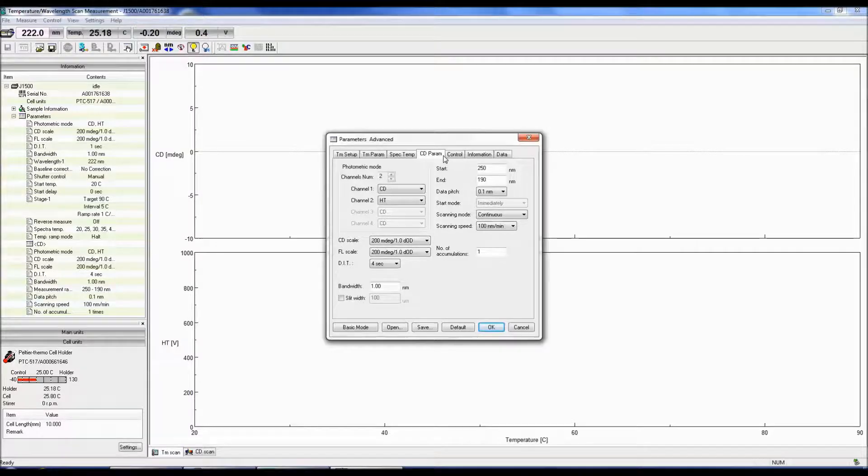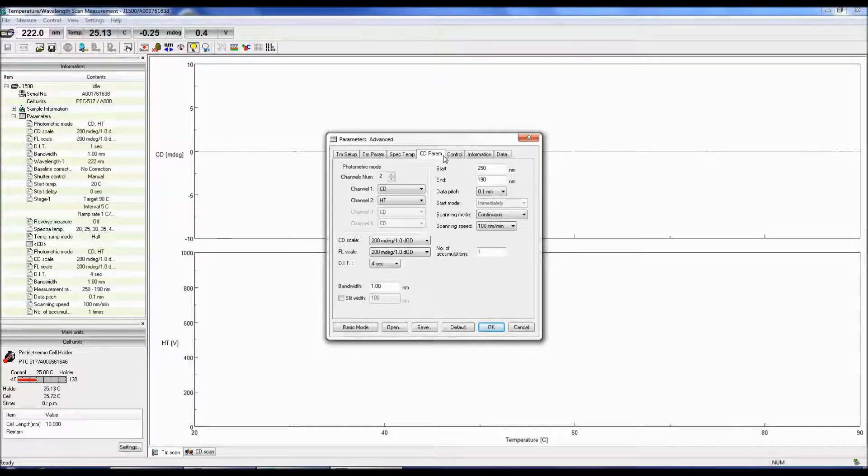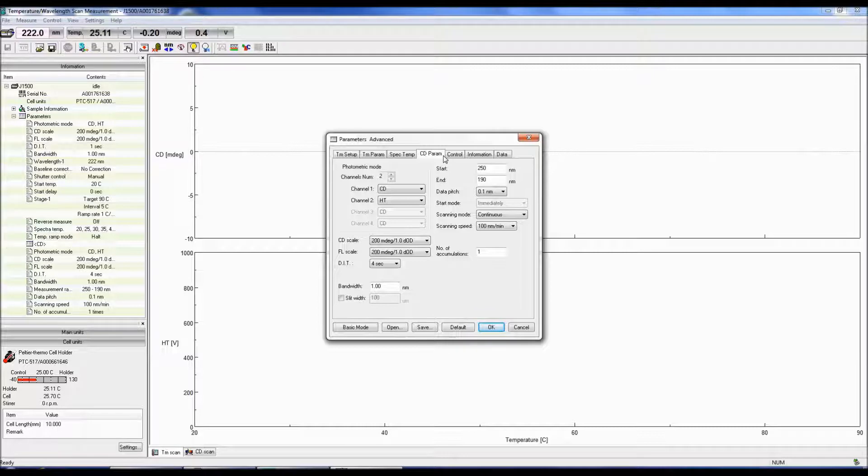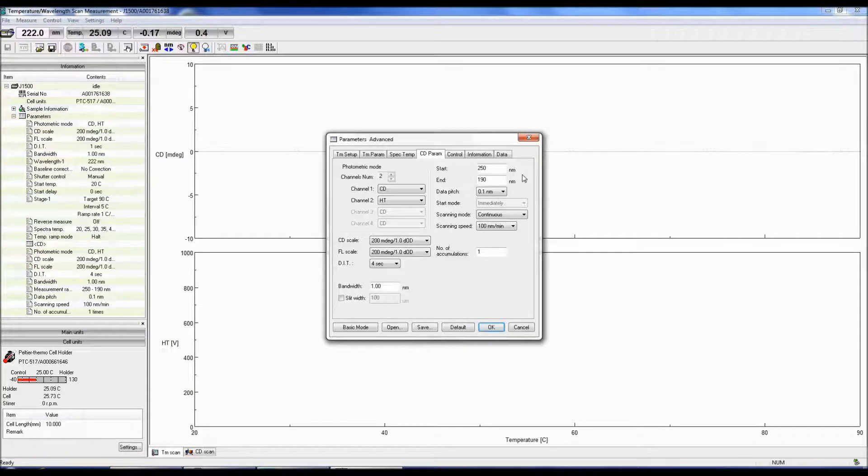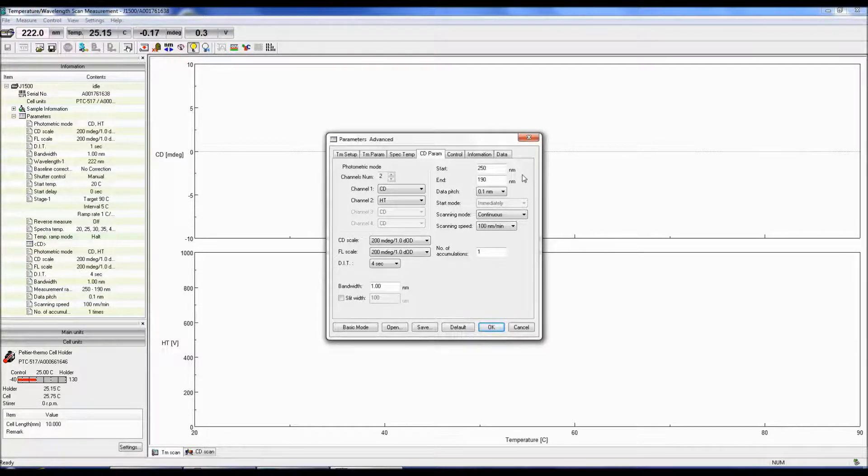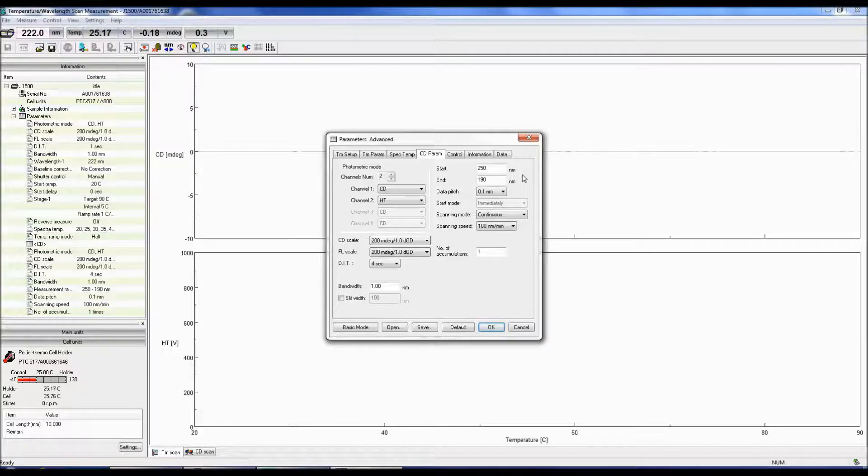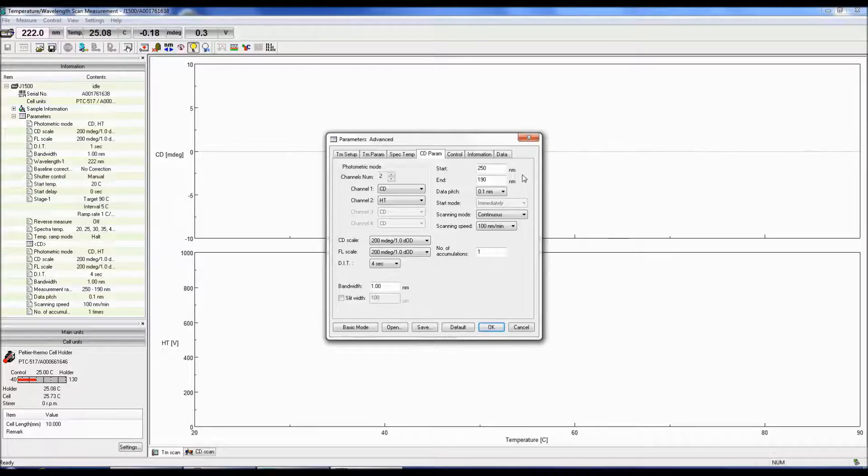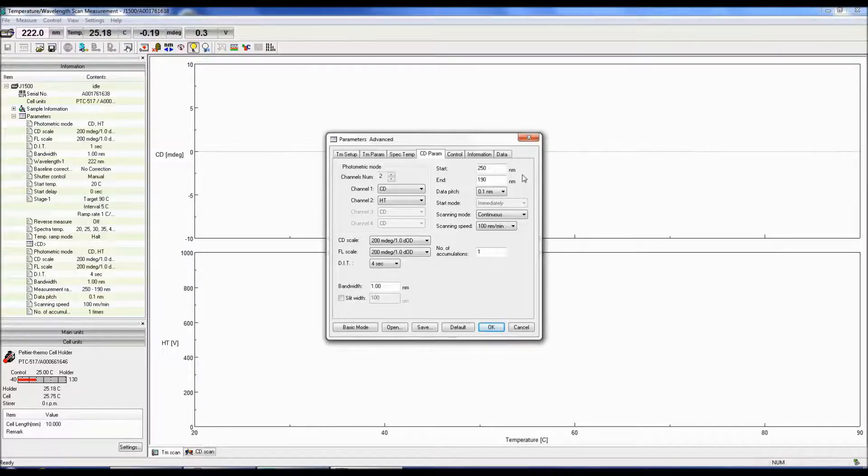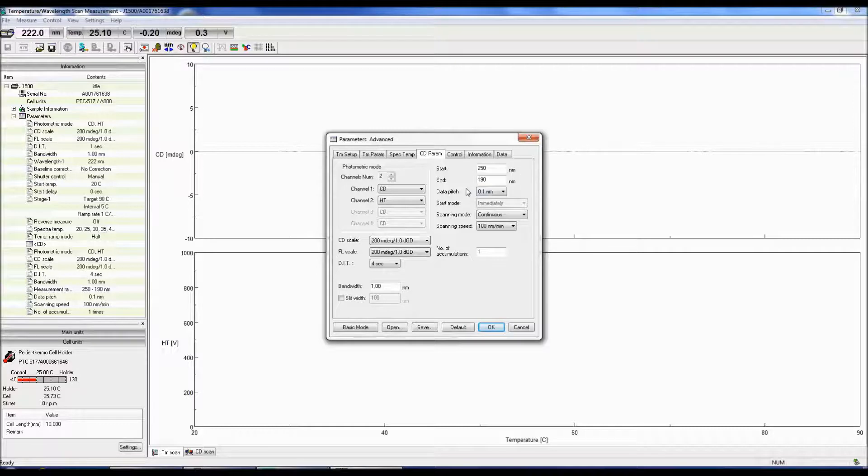Here I will just discuss the parameters that were not mentioned in the TM Parameters tab. The Start and End fields determine the wavelength range for the measurement. For secondary structure studies, measurements are typically obtained between 185 to 250 nm, and tertiary structure information is acquired between 250 to 350 nm.